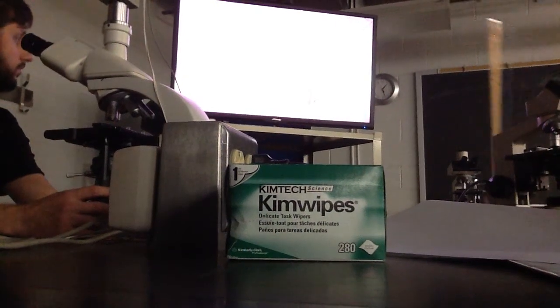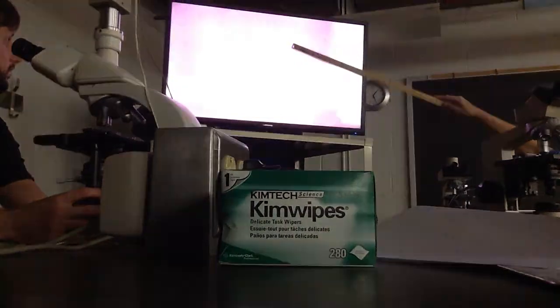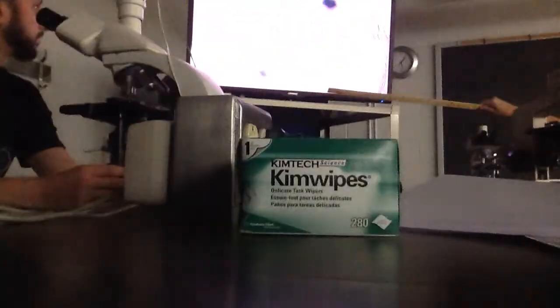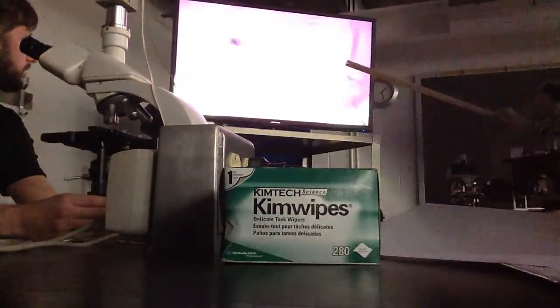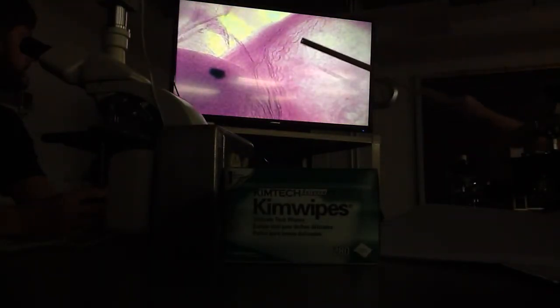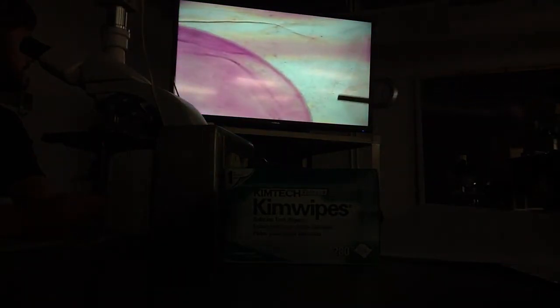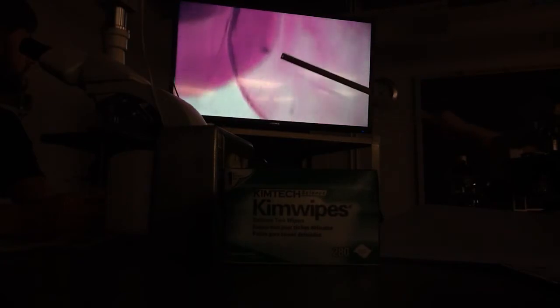Forelimb bud. All right, so that's forelimb. If we follow the axis now, past the somites, here is hind limb bud. And then extending out from that hind limb bud, going out into space, find one edge of it. Follow this structure here. Go around this round, down here, back in, all the way back to where we started. What is that? That is the allantois.